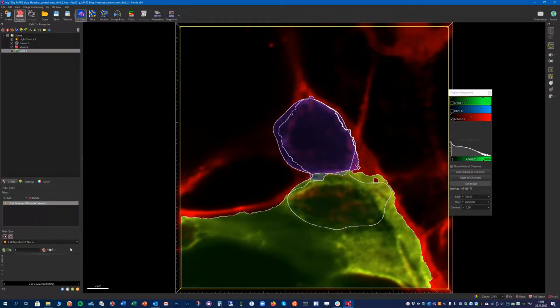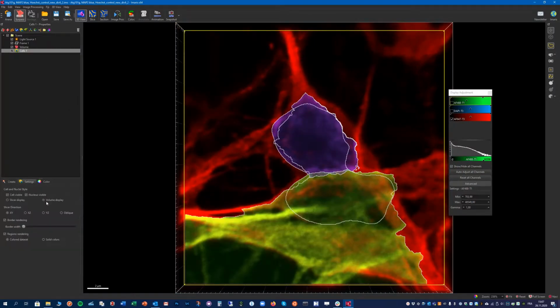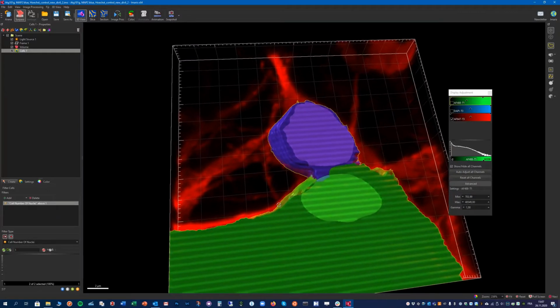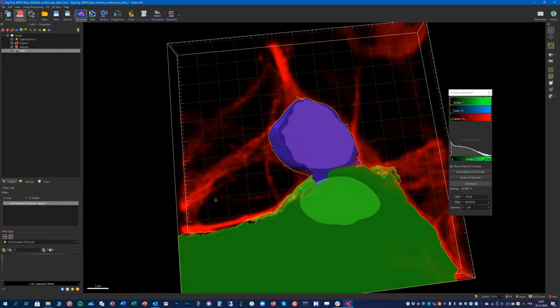So it's doing some processing here. And again, here there is already a filter, cell number of nuclei above 1, 2 of 2 selected. So those are the 2 cells. And we have again the view from the orthogonal slicer. I like the volume display better here. So this is the area that is now selected using the membrane instead of the cytoplasm.